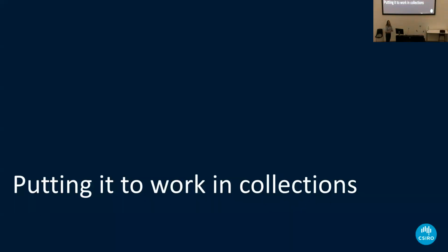We got it to work in mice, lab mice. That's great. We did some intentional fixation under conditions that we knew were going to work really well for our types of assays. We want to put it to work on actual museum specimens where we never met the curators, we didn't see it happen, we don't know what's going on.